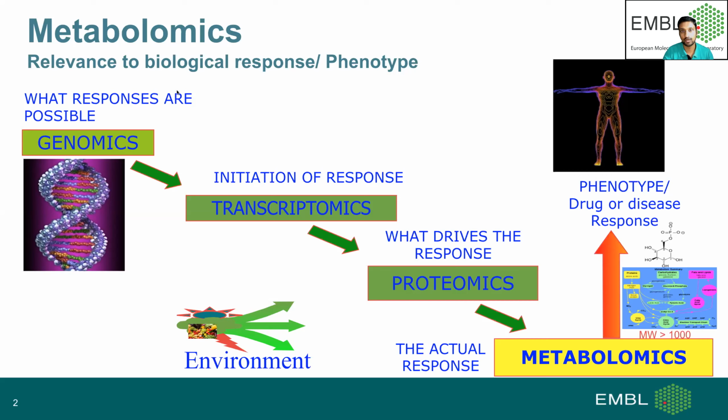And there is something further downstream: once you get this snapshot of phenotype, you can go further downstream to know the kinetics of it, which is called fluxomics, which is also an upcoming branch, a sister branch of metabolomics. So this is just one part of the story where we can capture information with metabolomics.